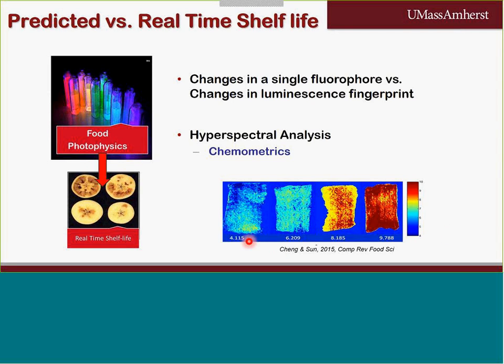So we can see that at the beginning it has about 4 log cycles, and it went up to 9.7, according to the authors. Both Zoom and Badramidis have in the last year published reviews on hyperspectral analysis. So if you're interested in these techniques, I suggest that you consult this literature.